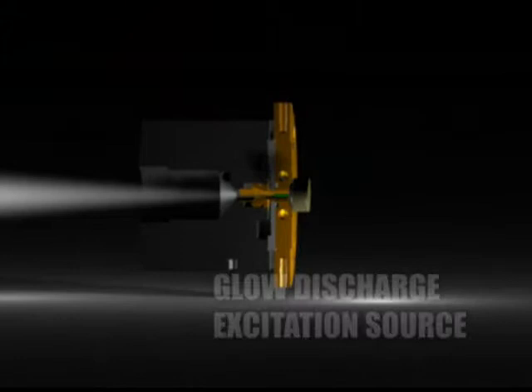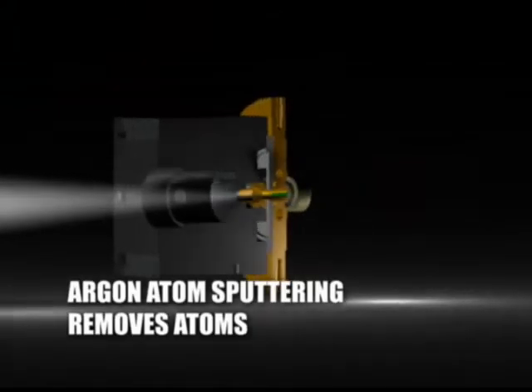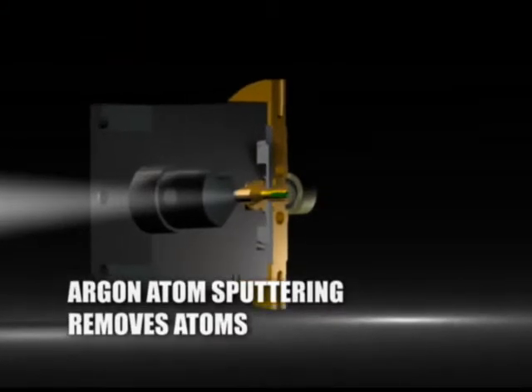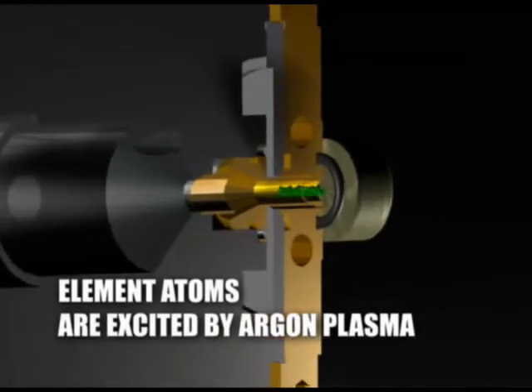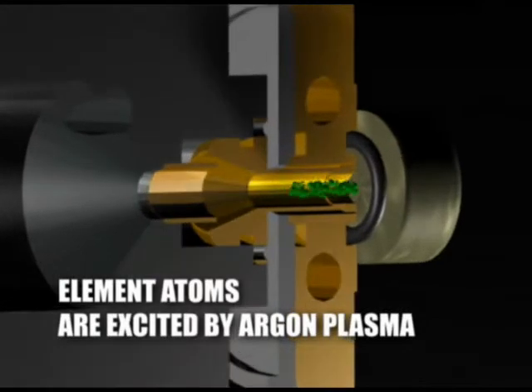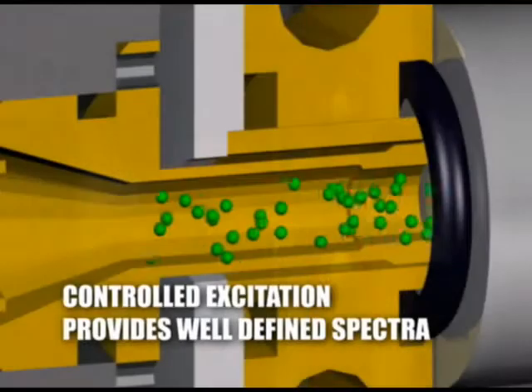Glow discharge excitation is a sputtering process controlled by the lamp voltage, the plasma current, and the argon pressure in the lamp. These conditions create an argon plasma where sample sputtering can occur. Argon atoms sputter atoms from the sample surface. Sample atoms in the plasma are excited by the argon plasma and emit characteristic spectra of each sample element.